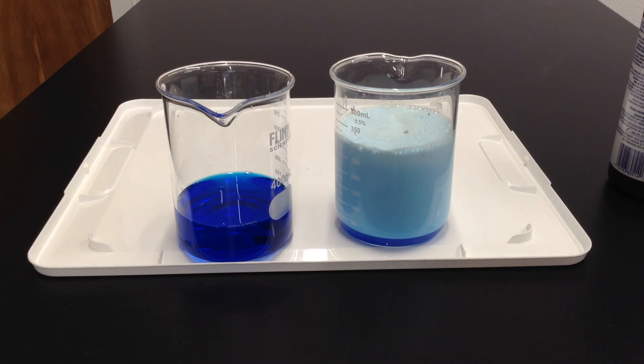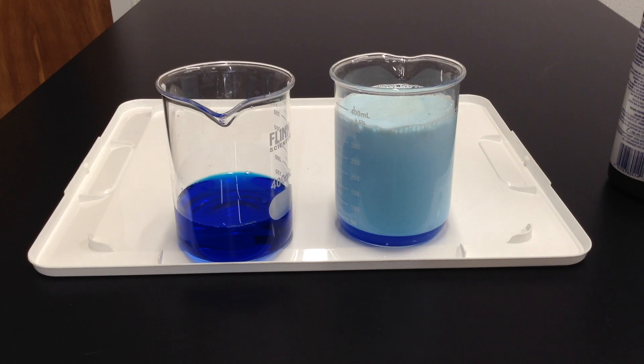This is kind of the old elephant toothpaste experiment. Now if we wanted to make it more dramatic, we would add more catalysts, more yeast. Or we could increase the concentration of our hydrogen peroxide. We're working on this one side — that being said.